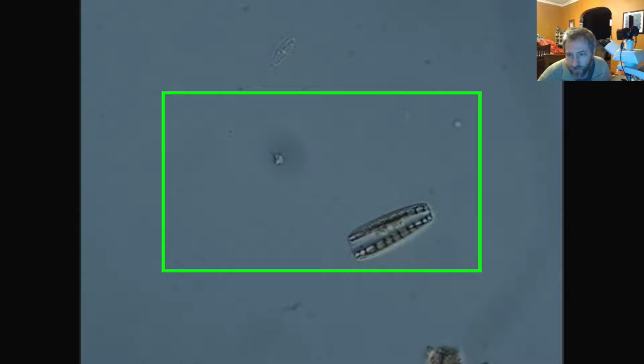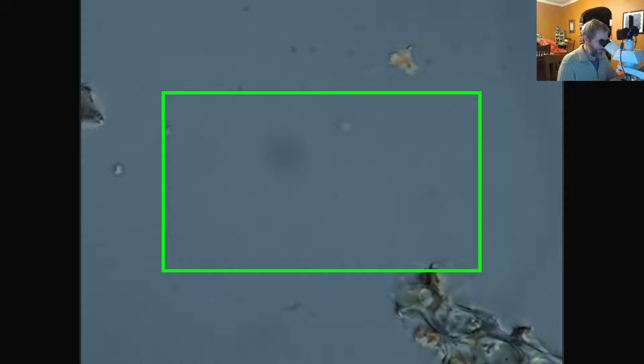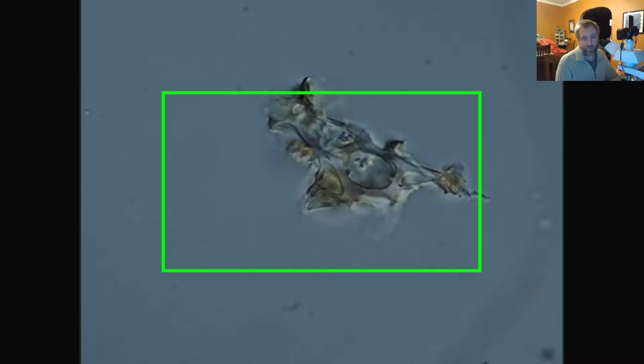Phibot says, what's that brown bacteria-looking thingy? This one? This thing, right here? I don't know. Probably a bit of plant material. It's not bacteria, that's for sure. But it might have some bacteria on it.